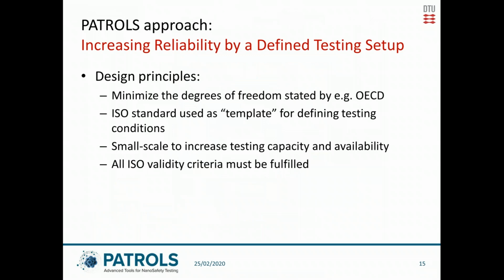So the PATROLS approach to making better algae tests is actually to propose a defined testing setup, and in that way we aim to increase the reliability of the tests. Our design principle for doing this is that we need to minimize the degrees of freedom that is given by the OECD guideline.